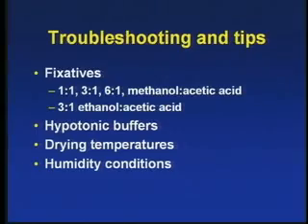If you do everything after that, when the fixative is evaporated, you can never change the outcome of your chromosome spreading. So anything you want to do to improve that has to be done before. That will involve many factors. The solution you use, because that will determine how much force the solution will apply on the cell, and that also determines how long the evaporation will take place, and this kind of thing. That's why we get into some of the tips and troubleshooting for getting a good chromosome spreading.